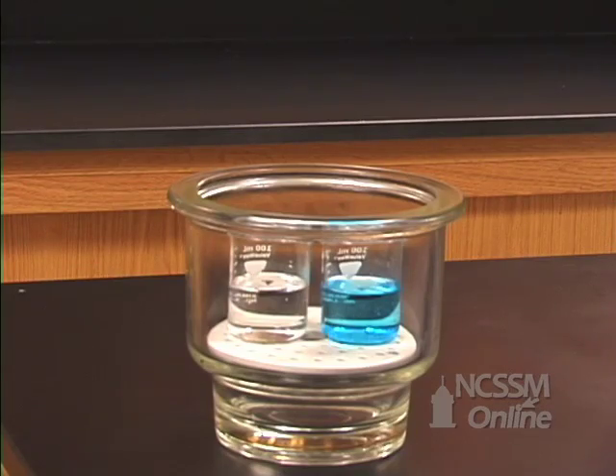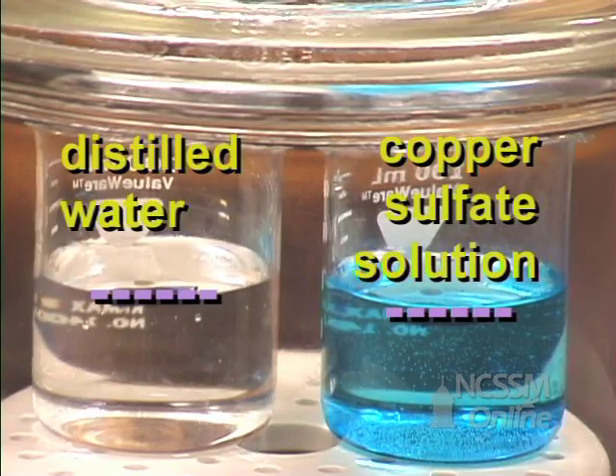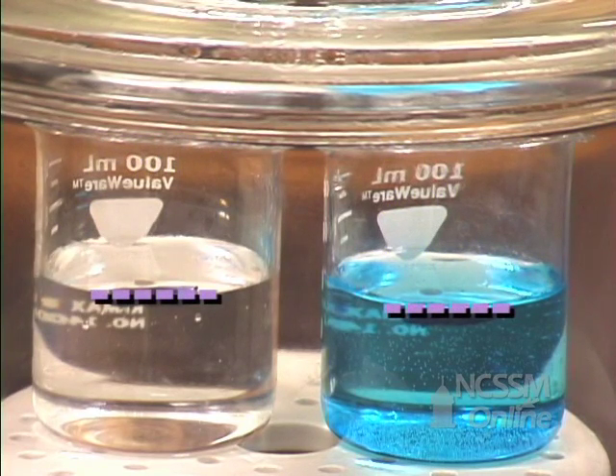Inside we have a beaker of distilled water and a beaker of a copper sulfate solution, and you can see that we've marked them at the same level. So what we're going to do is observe what happens to the liquids in each of these beakers over time.